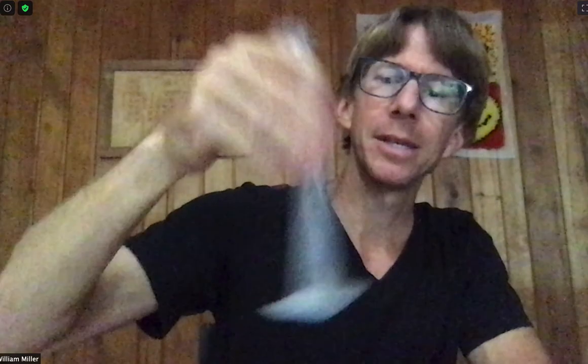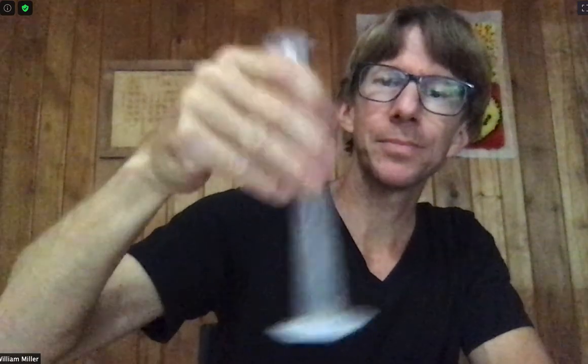Because if we spill any solution, there will be some salt dissolved in it and it will throw off our calculations. So just keep swirling.